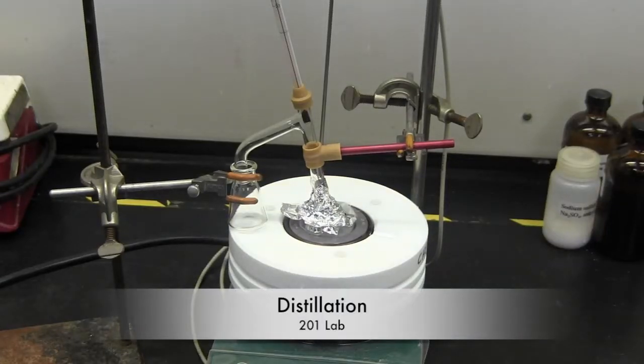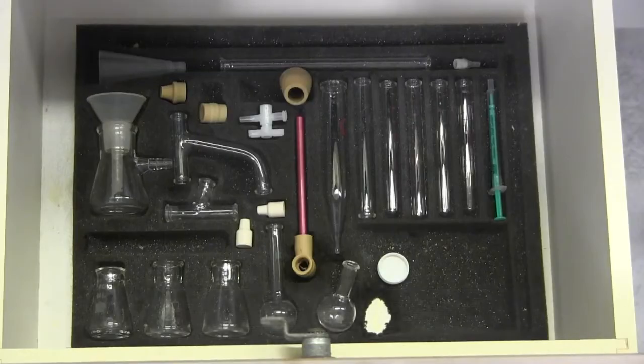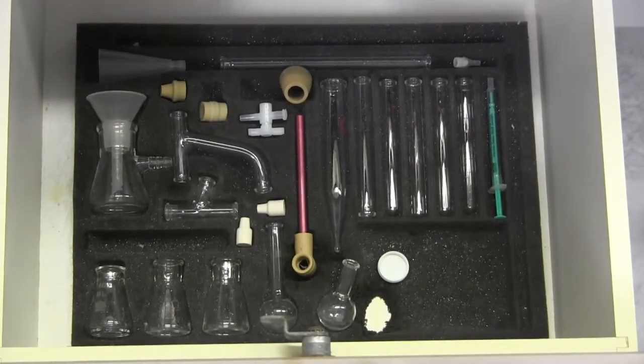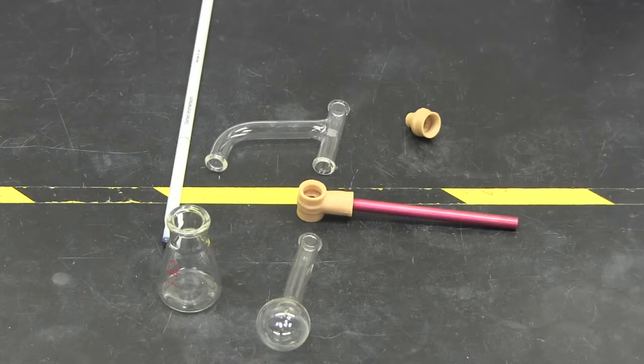In this lab, you will use distillation to separate your unknown from an impurity. You will be using the non-condenser distillation kit in your drawer for this lab. You will also need a glass thermometer and aluminum foil.